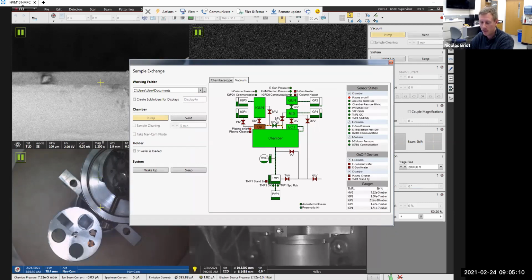When you do light microscopy, when you use a stereo zoom microscope or a compound microscope, you're using photons, regular light, or at least maybe a special wavelength if you have a special light source. But because you're using a signal that has a wavelength in the few hundreds of nanometers, you cannot see something much smaller, right?